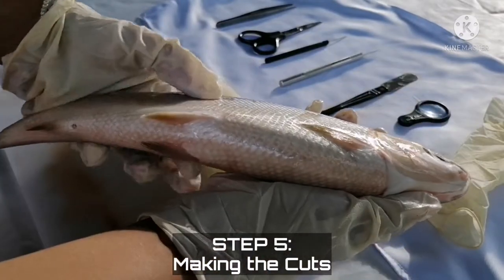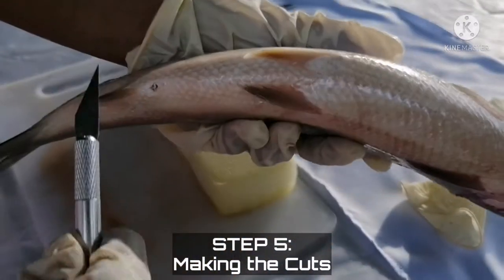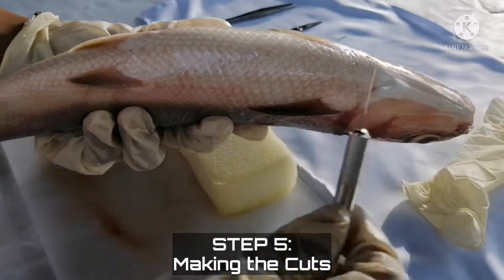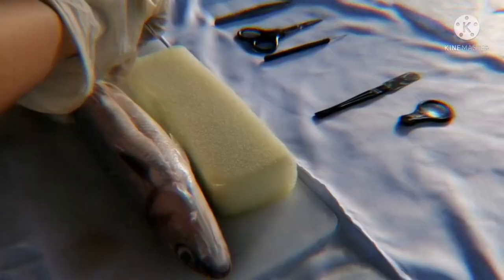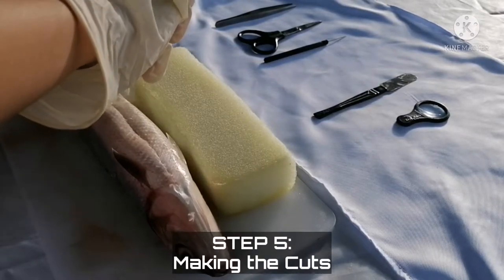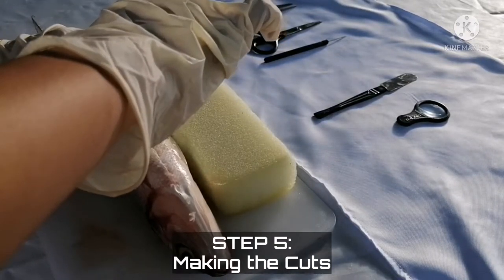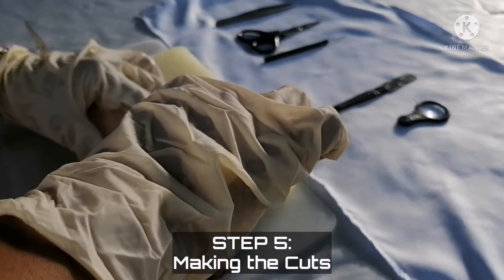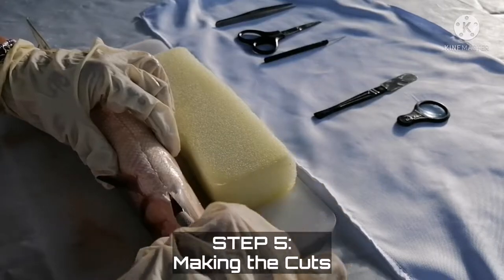The next step for dissection is to cut the fish from the anus up to the gills. You need to be careful in cutting the fish open from the anus to the gills to avoid the breakage of the parts.